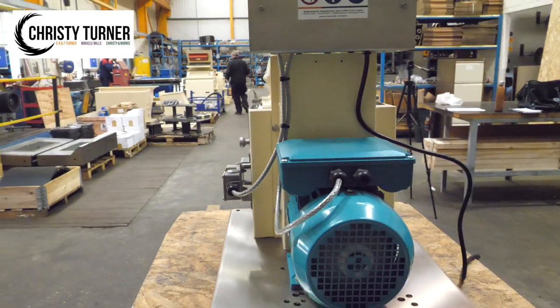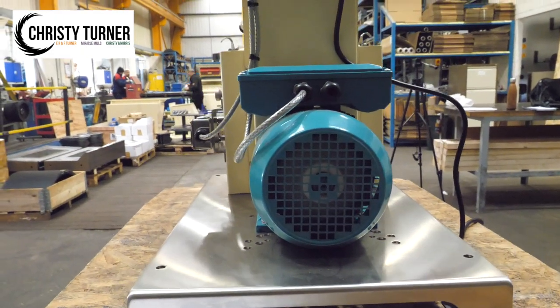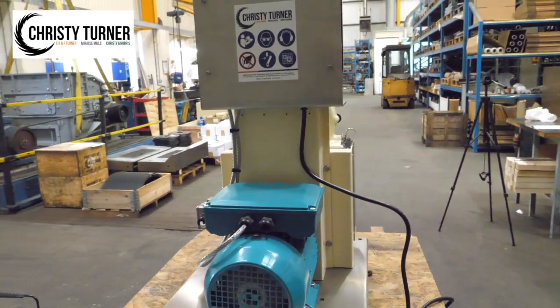The lab mill is delivered on a stainless steel plinth to minimise vibration and lend itself perfectly to laboratory conditions.